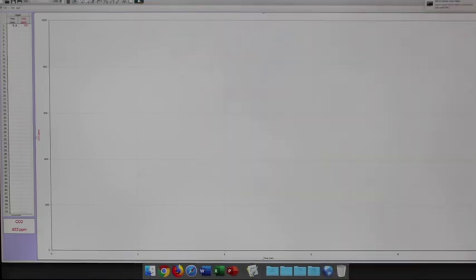So I'm going to click play up here. And I'm going to allow that to get started then. Okay, here's our line. If our crickets are going through respiration, should we have an increase in CO2 or a decrease in CO2? So respiration puts out CO2, and so we should be able to see an increase, and so that line is moving up like it should be moving up in here. Okay. And so now I'm just going to leave that running for 5 minutes. And then we will come back in 5 minutes.